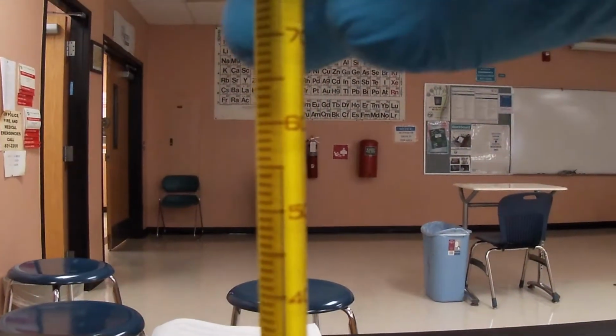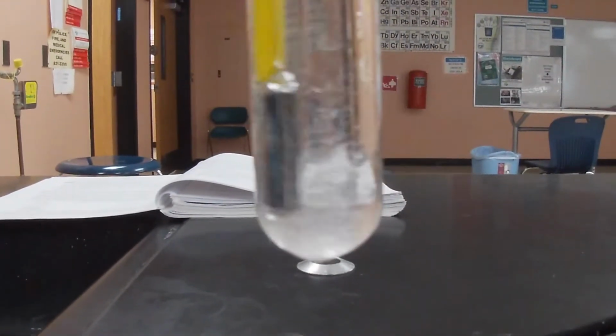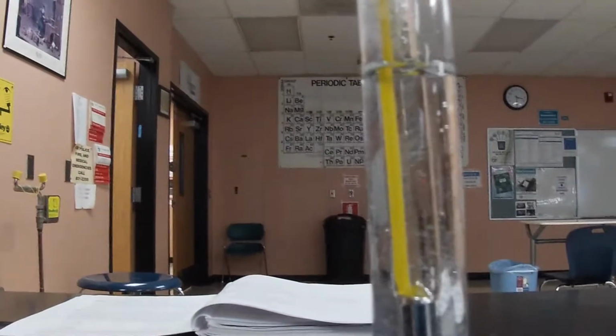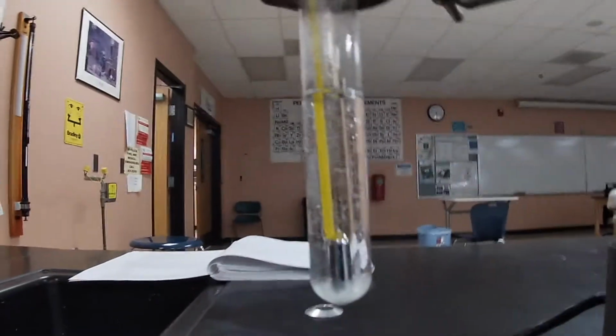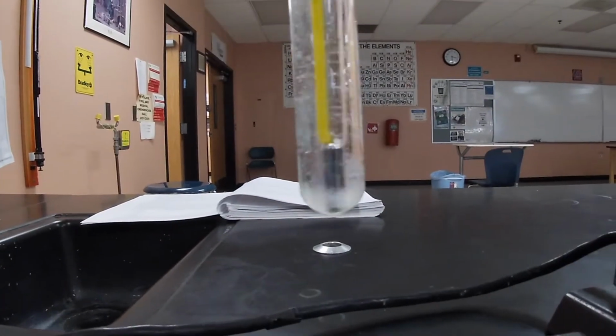Temperature's dropping. 55, and you can already see the crystal formation. So, as you can see them already forming, make sure to record that temperature, and we're good to go. Go ahead and make your plot, and then just extrapolate and extend the line back. Looks like a snow globe.